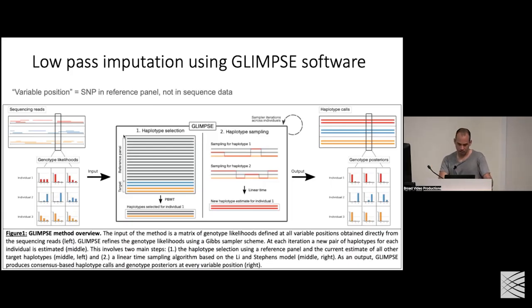and then you take those genotype prior likelihoods that you get across, say, whatever number of millions of imputed variants that you're wanting to impute, and then you run through what is seen as the more traditional imputation pipeline, where you phase, select haplotypes, best guess haplotypes. You run a hidden Markov model through and sample through haplotypes doing this.